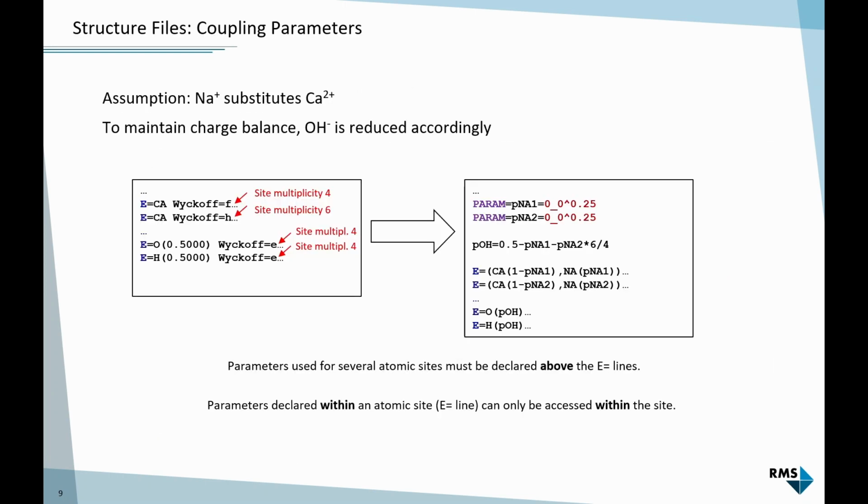Okay, so you will have time this afternoon to implement this in my example number 1. And the result should be very nice, because example 1 is a synthetic mixture of calcite and apatite, and you will see how much I mixed once you see the result. It's quite obvious, but yeah, we can try this.